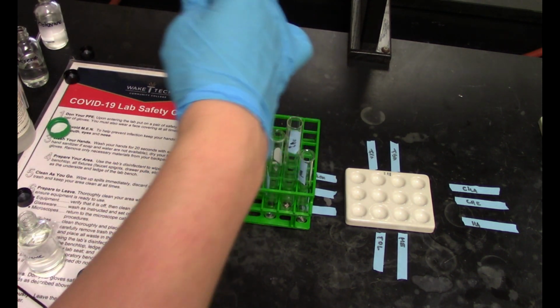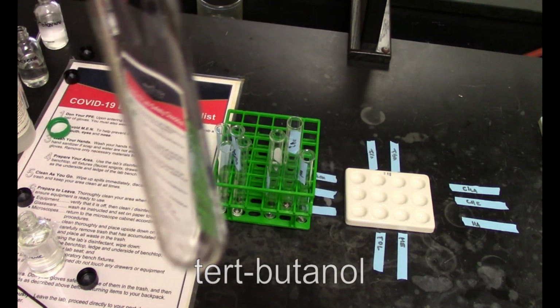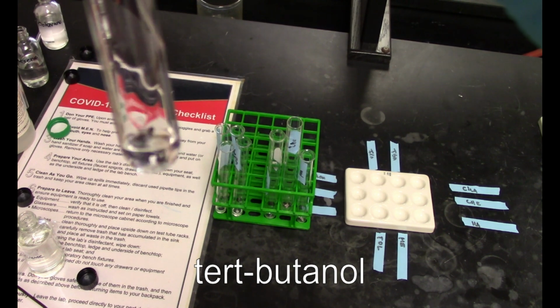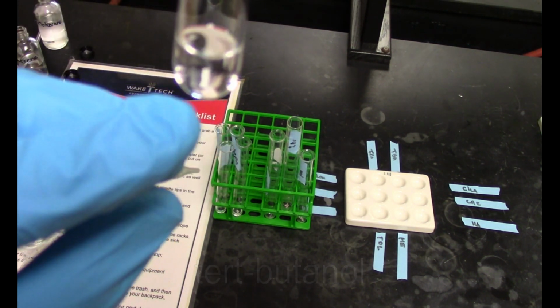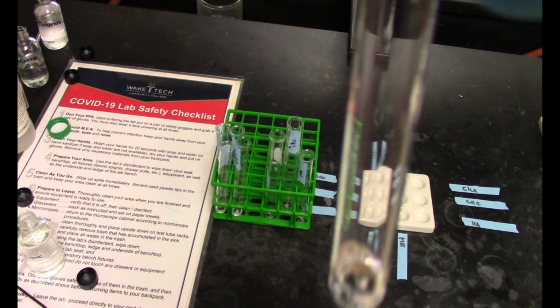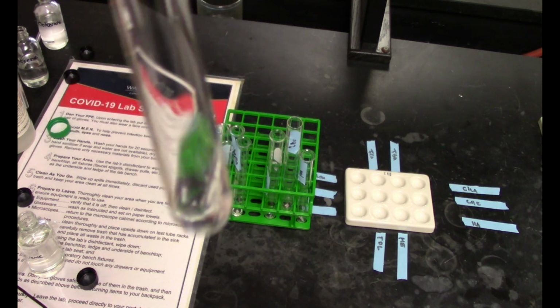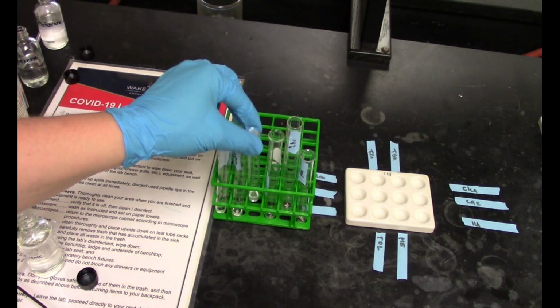Now we're going to add the tert-butanol. And our tert-butanol, we add it, it's probably again very hard to see on your end, but there's a very fine stream of bubbles coming up from the sodium. This is not nearly as pronounced as was the ethanol or the 2-propanol, but we do in fact see a reaction. This is the production of hydrogen.